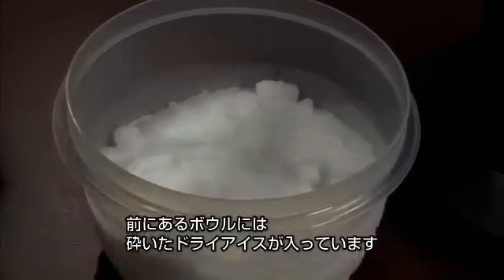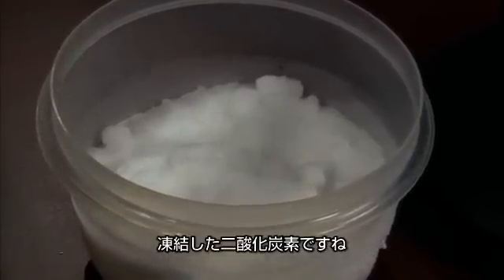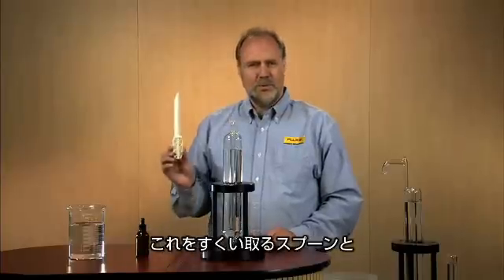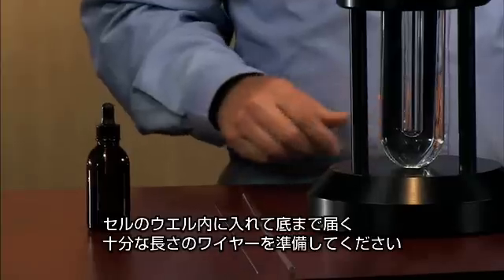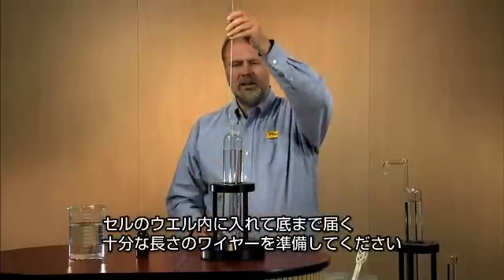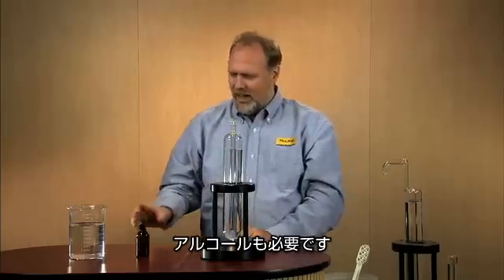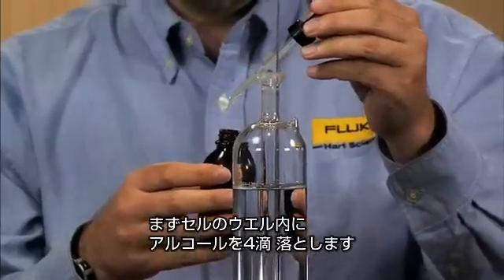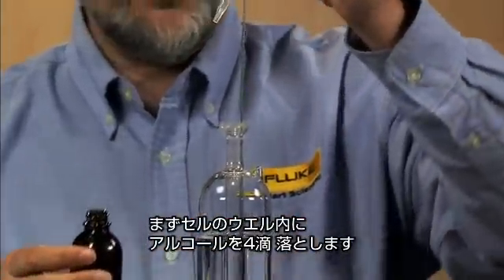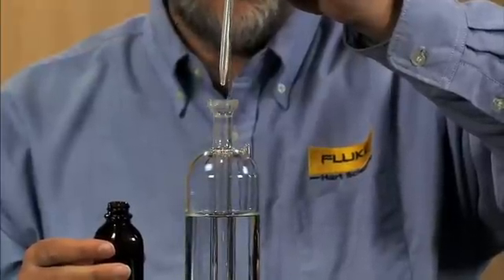In front of me, I have a bowl of ground-up dry ice or frozen carbon dioxide. I have a spoon to scoop it with. I have a wire long enough to go into the well of the cell and stand there. I have a bottle of alcohol. We're going to put four drops of alcohol into the well of the cell — one, two, three, four.